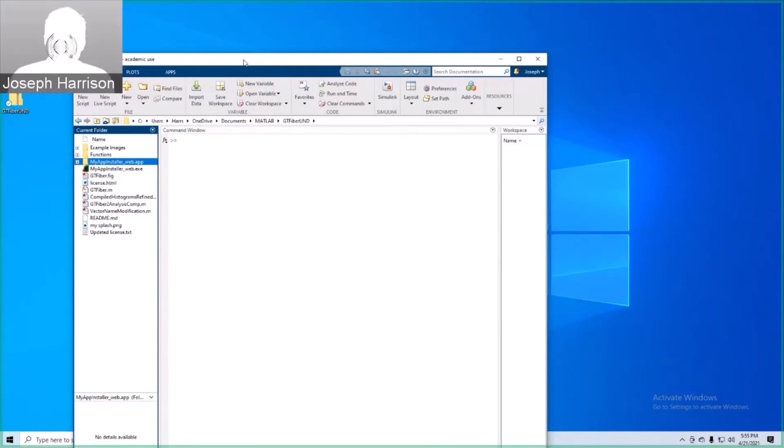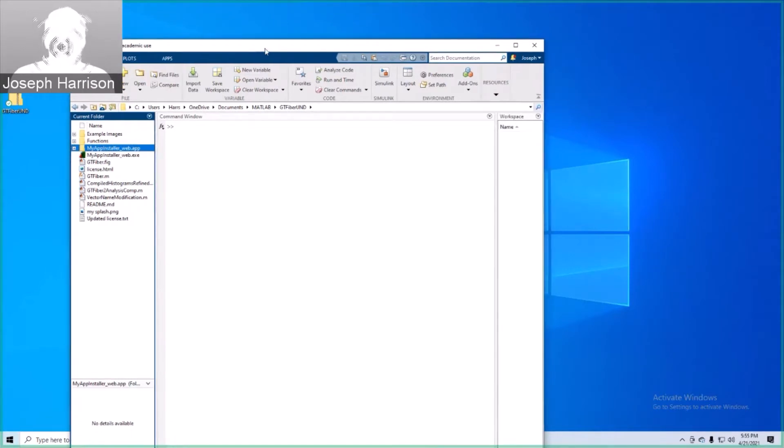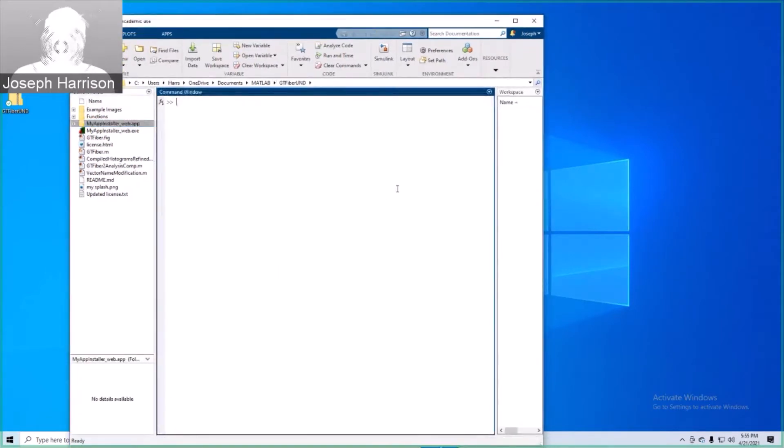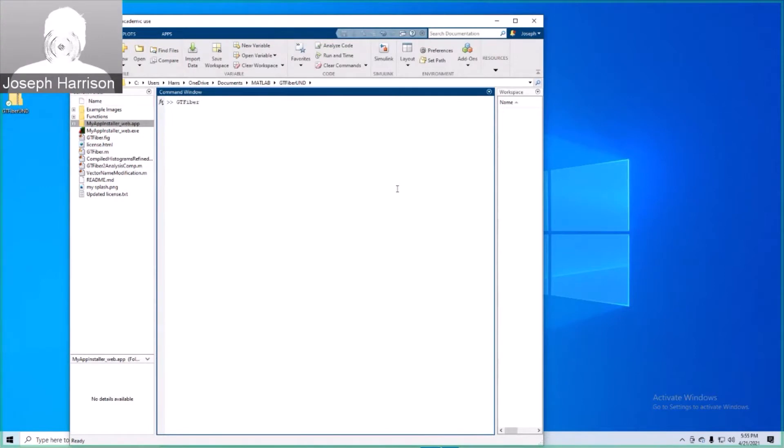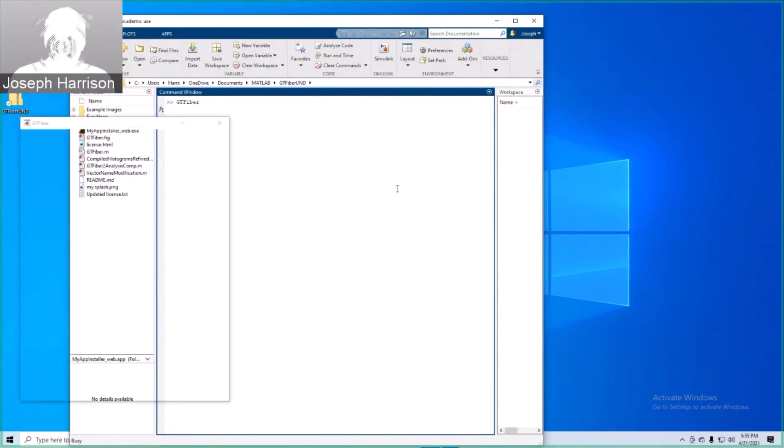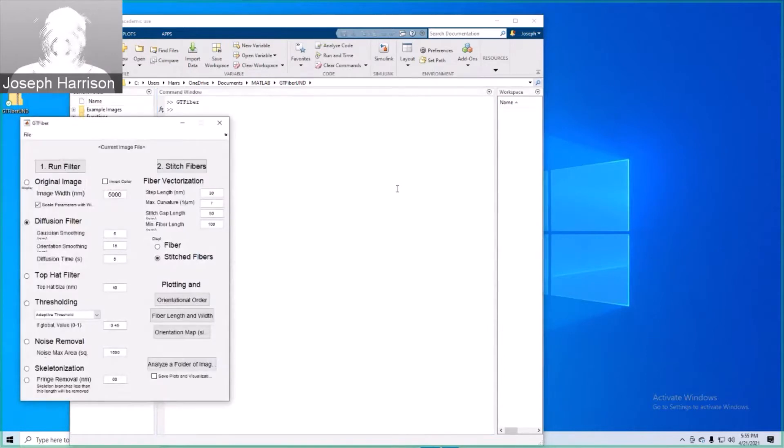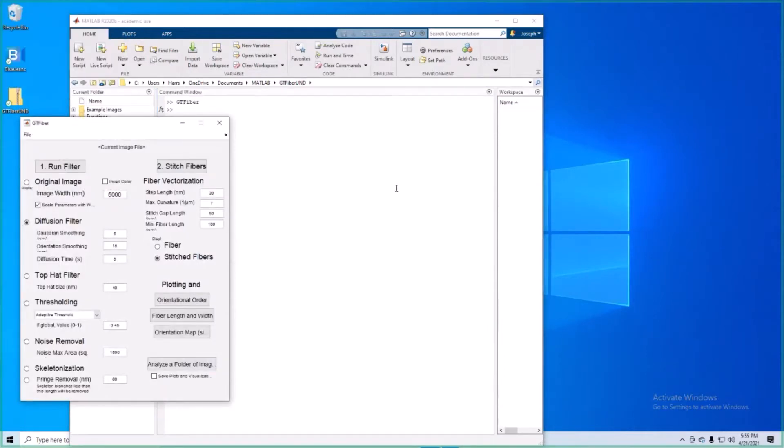Alright, now we are going to go ahead and launch the GT-Fiber GUI. What we're going to have to do here is simply type in GT-Fiber into the command window as is displayed. This launches the GUI and prompts a couple of user inputs.